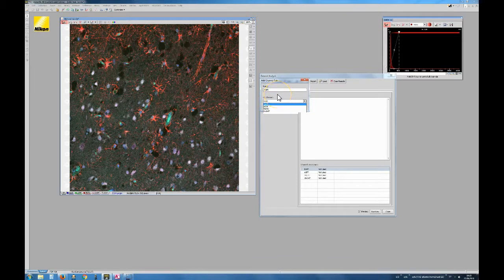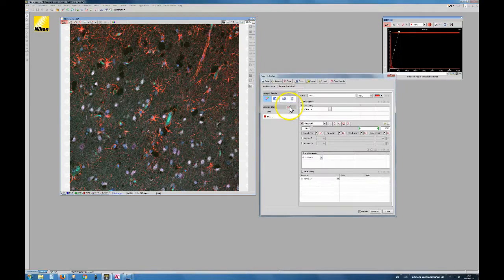Right now I want to find the astrocytes so that I can interrogate the intensity of the green and the far red inside the astrocytes. The astrocytes are in red, so I'm going to select TRITC, and then I say OK. So now I have my first channel here.